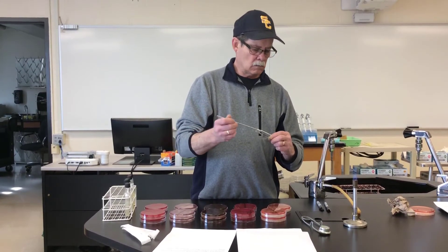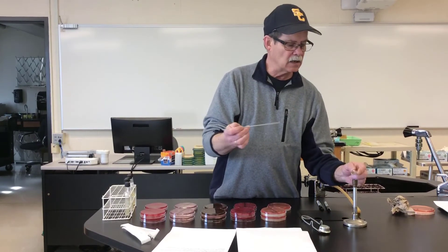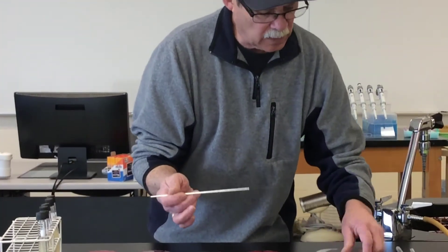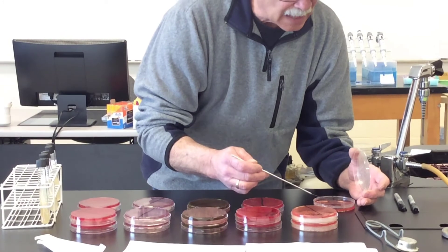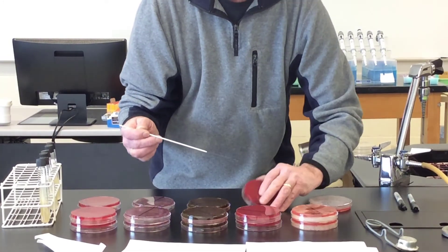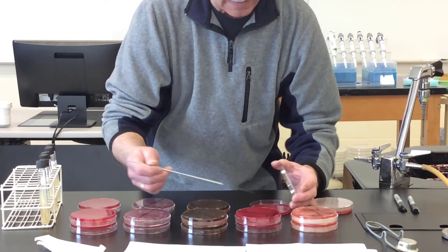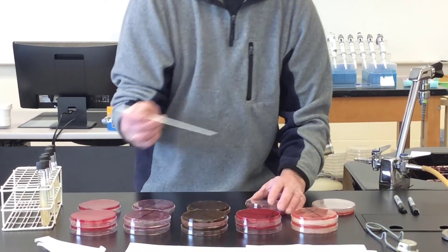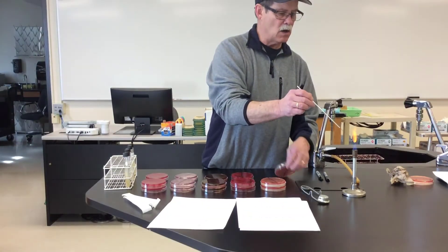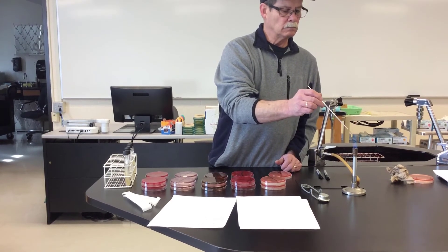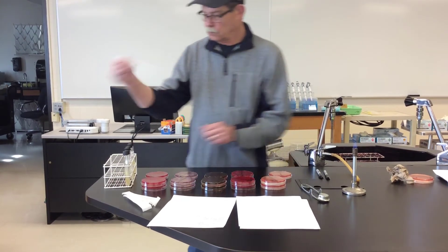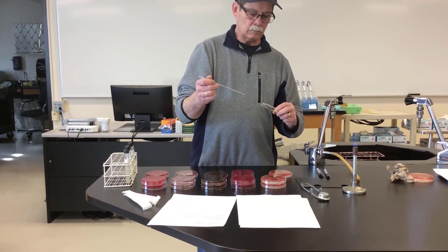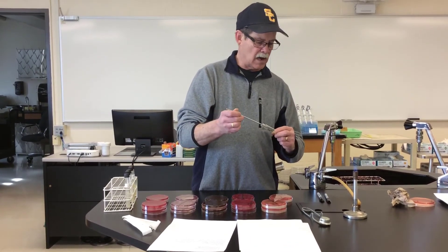Go in and grab a small amount of the bacteria. Go on to our first plate and we're just going to do a straight line. I have enough on here to easily go on to the CNA, and I will do a straight line there. I'm going to go ahead and flame this now. We'll go back and get a little bit more. Remember to cool your loop a little before grabbing an organism.